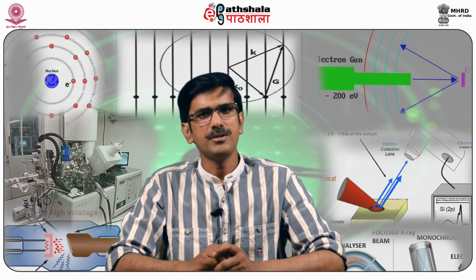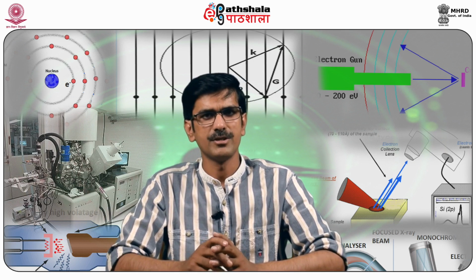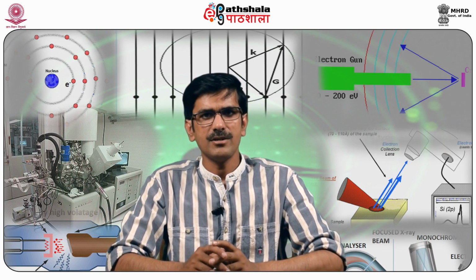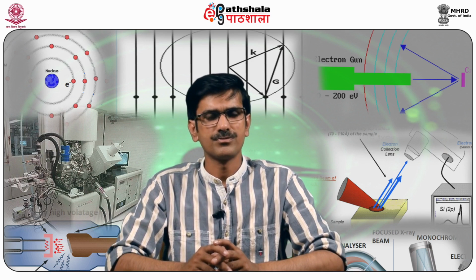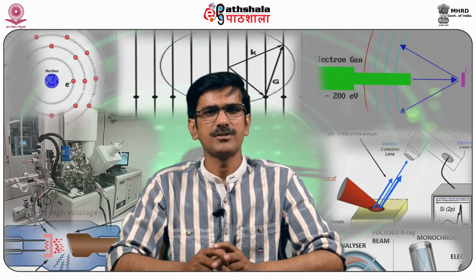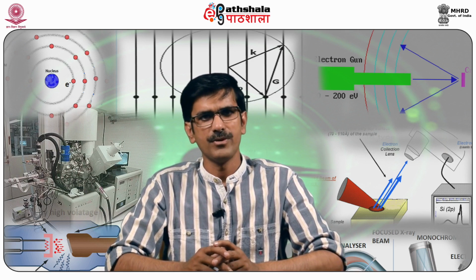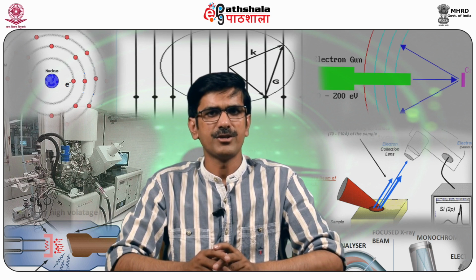In order to get the best results, there has to be a balance between the count rate and the resolution limit. By extending the period of measuring each X-ray, spectral resolution can be improved. When two photons arrive at the detector at the same time, they are not measured as separate events.